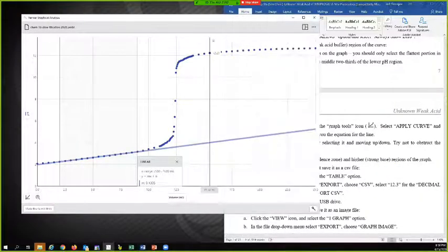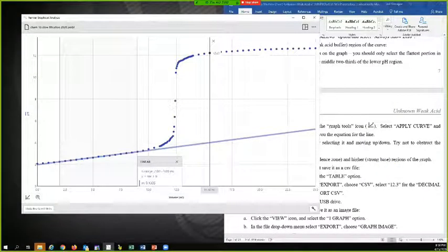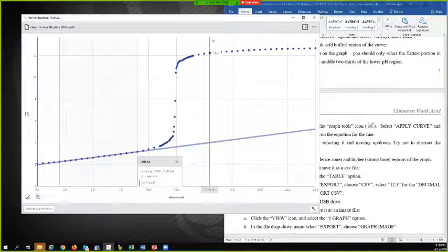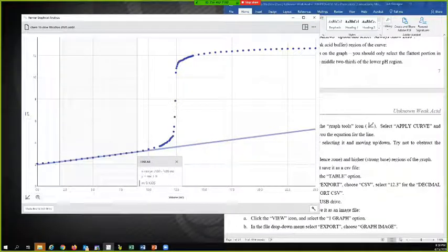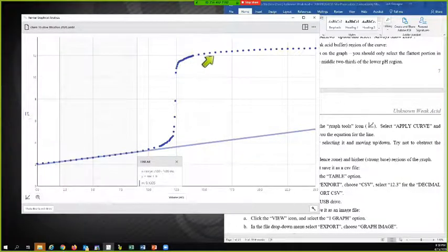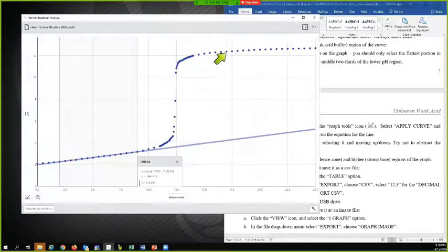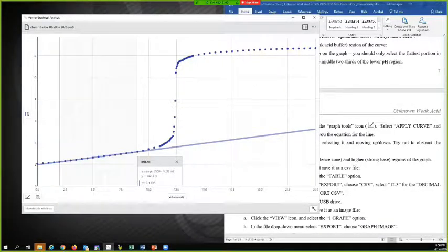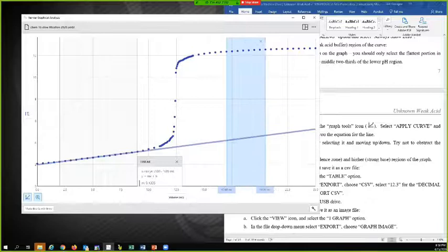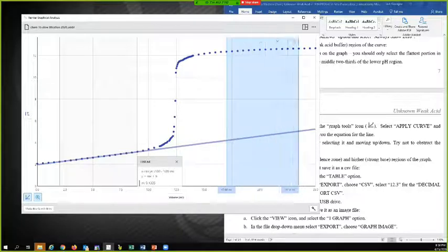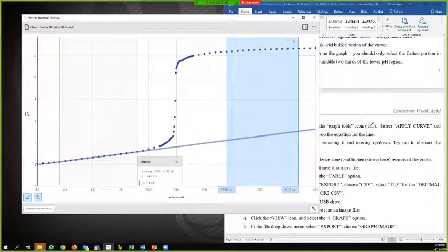So it's kind of curving here. And so I want to go more in the middle of this. Maybe from here to here. About that. That looks okay. I'm going to select that.